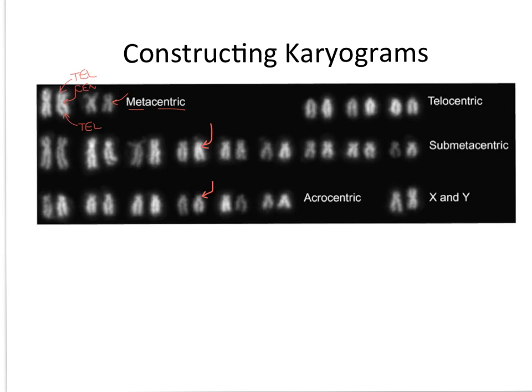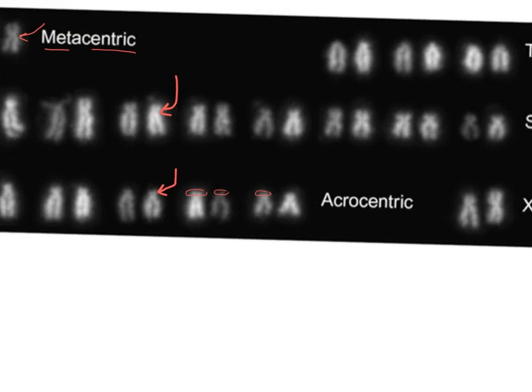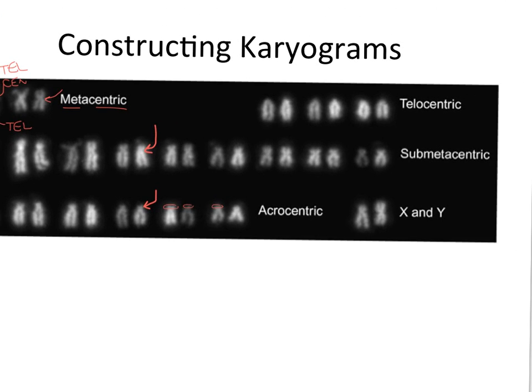In the acrocentric chromosomes, you can see a tiny little bit of nucleic acid above the centromere on each chromosome. This is the main distinction between an acrocentric chromosome and a telocentric chromosome, where it appears that the centromere and the telomere are essentially the same object. There is no short chromosome arm as there are in submetacentric and acrocentric chromosomes.